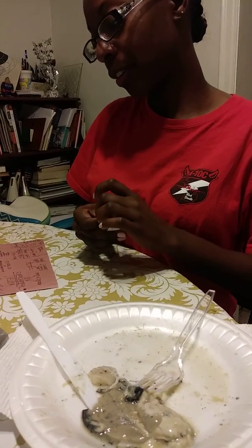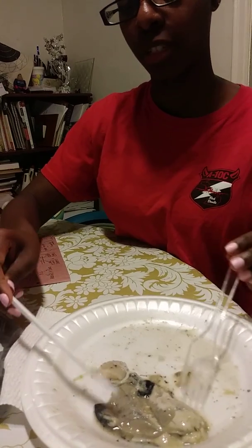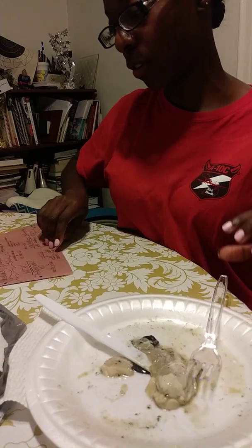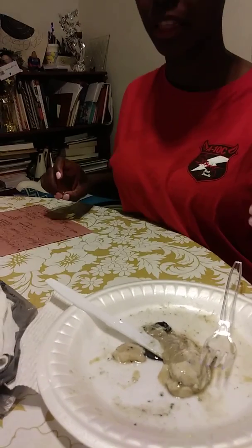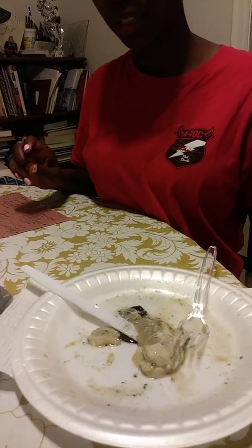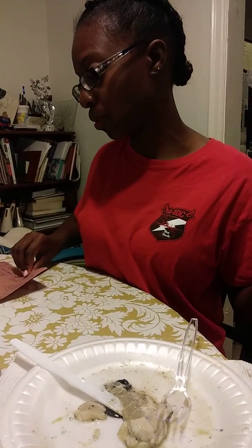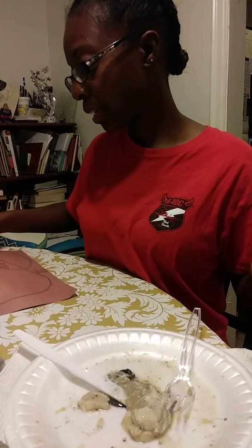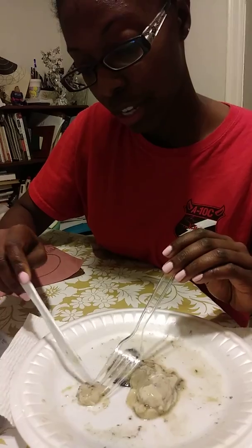And oysters are able to change their sex. They don't have a central nervous system, so they don't feel pain at all. And they produce pearls. They are not the only marine life form that produce pearls. Mussels and clams also produce pearls as well. And they have a 3-chambered heart. So this heart has 3 chambers in it. Can't really cut it open because it's so tough, but it's 3 chambers as opposed to the human 4-chambered heart.